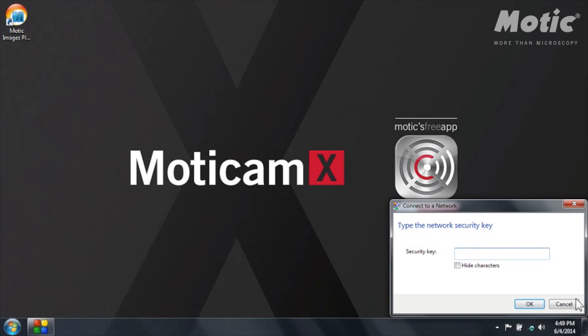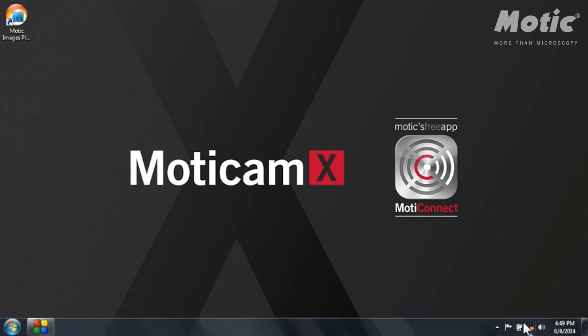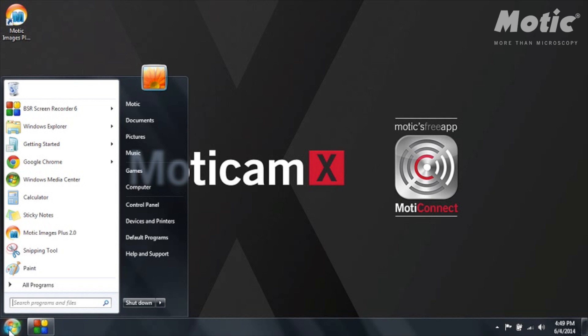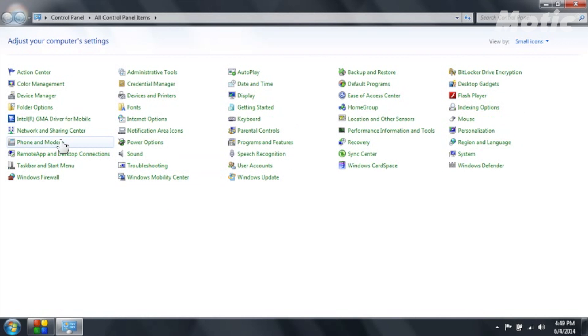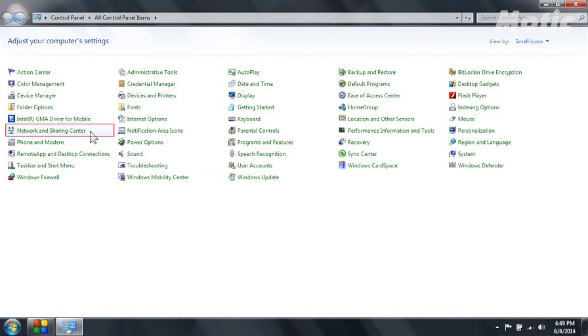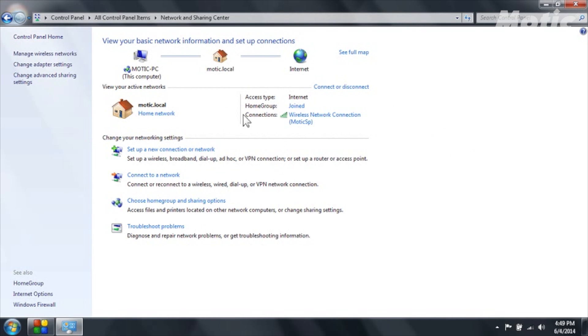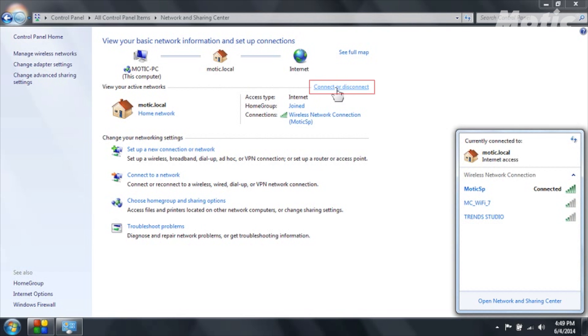In the case you would not find this icon on the toolbar you can go to the control panel of your Windows and then go to network and sharing center and here choose connect or disconnect. And you will have the same window that is opening.